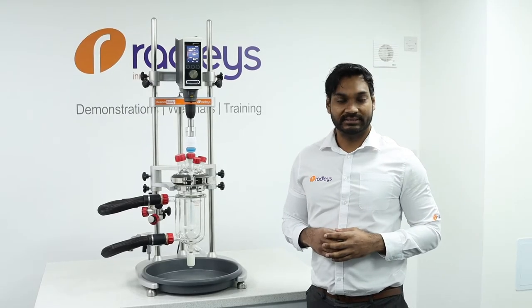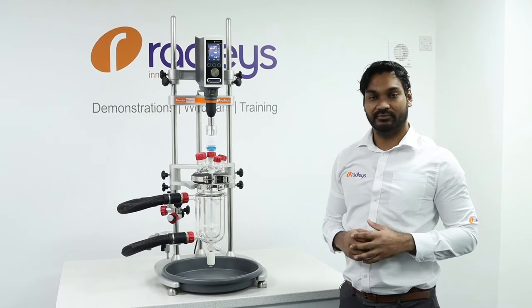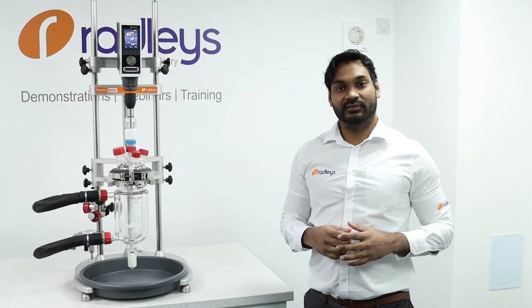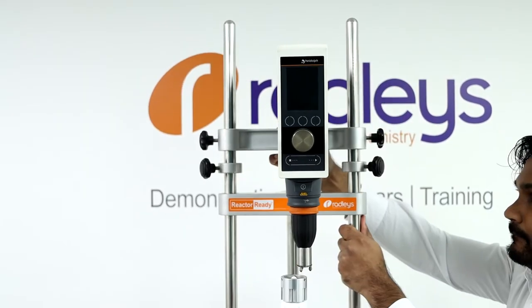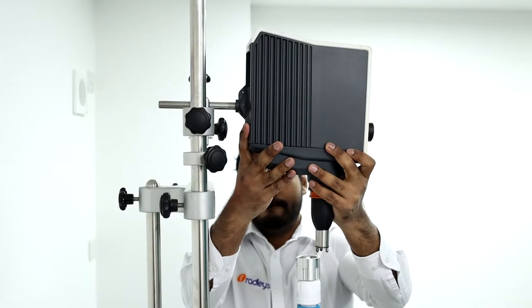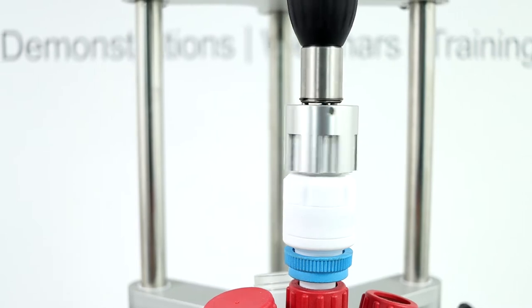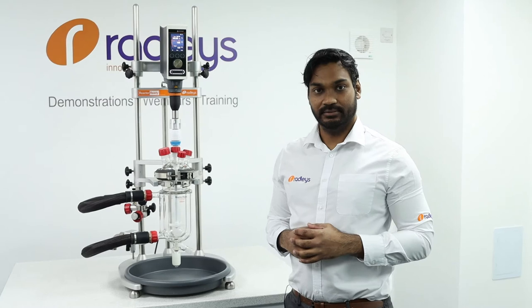Reactor Ready is different from traditional Jacketed Lab Reactor systems as we have an I-beam which supports the weight of the overhead stirrer. The unique design of the I-beam allows for movement of the overhead stirrer in three axes — up, down, left to right, and backwards and forwards — as well as rotation of the overhead stirrer. This design also prevents transfer of the weight of the overhead stirrer through to the lid of the vessel.